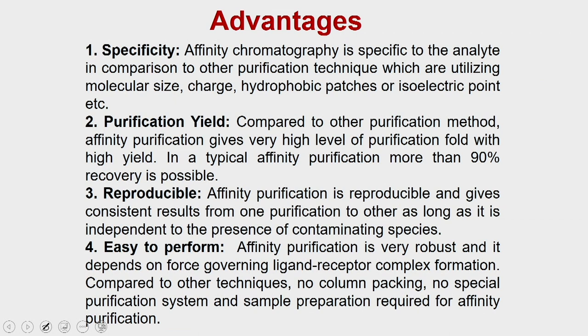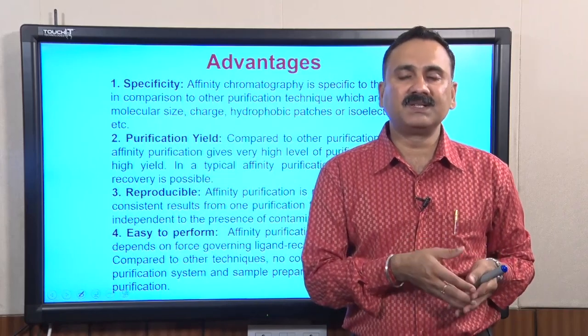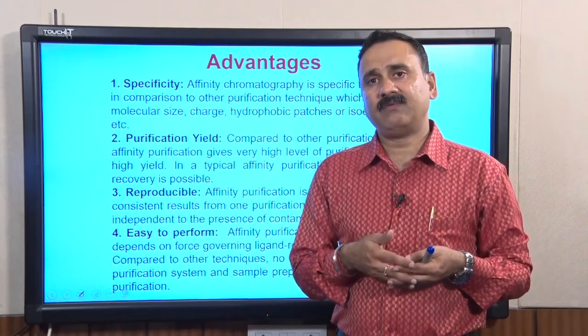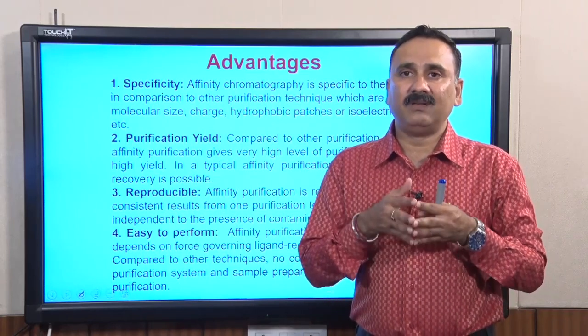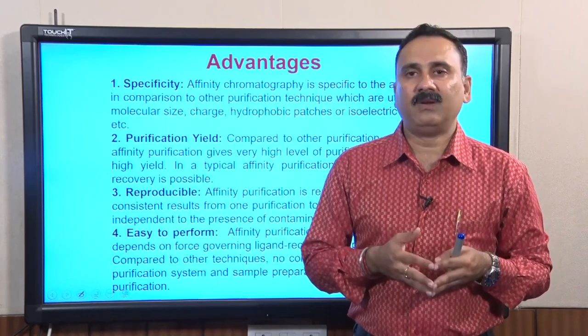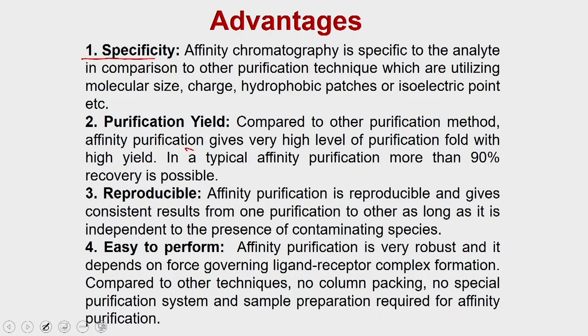Now, what are the advantages of affinity chromatography versus the earlier chromatography we have discussed, like ion exchange chromatography, hydrophobic interaction chromatography, or gel filtration chromatography? One of the major advantages of affinity chromatography is that it is very, very specific. So that will make the purification easier. As we discussed, the receptor is going to interact only with the ligand, and that's why affinity chromatography is going to be specific to the ligand or the receptor that you are using.